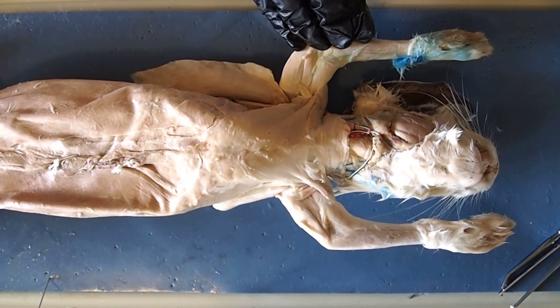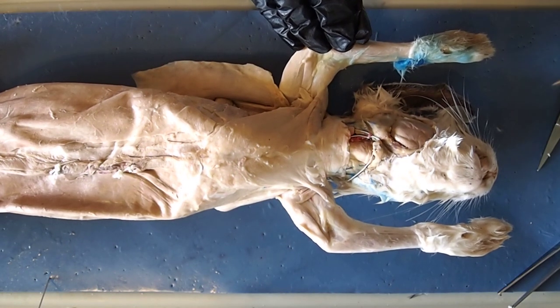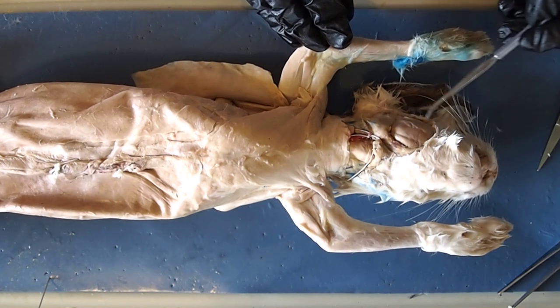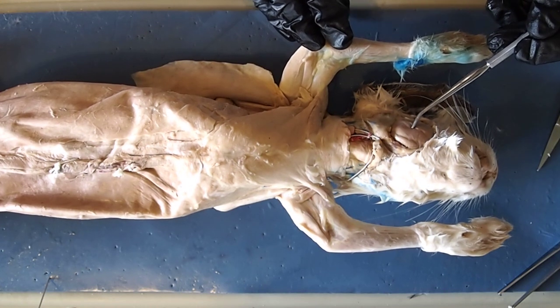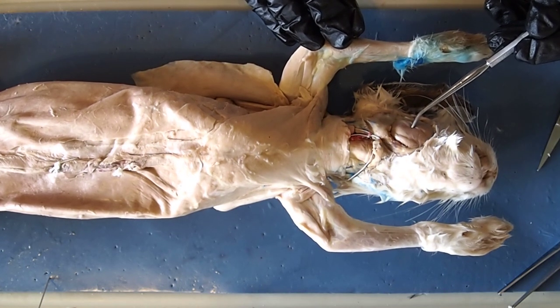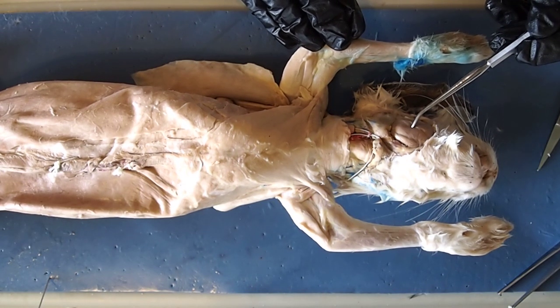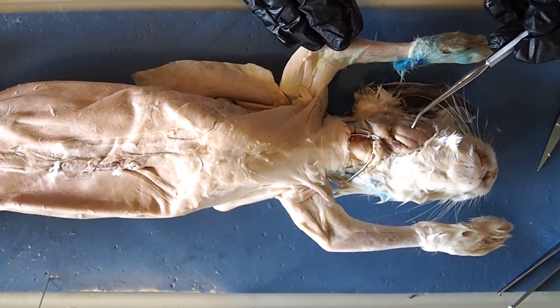The first muscle I'm going to show you is right up here on the cheek. This really large muscle here is called the masseter. The masseter is the muscle involved in most of your chewing. If you were to clench your teeth really tightly together right now, the muscle you feel on either side of your cheek is the masseter.